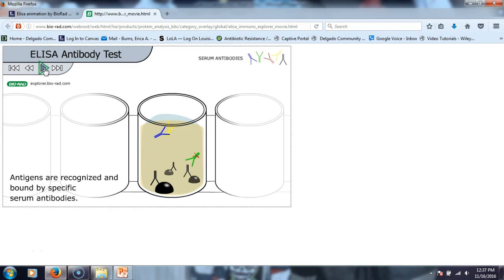We don't have to wear gloves or goggles or any of that today. And all the things that we use that are disposable can go in the regular trash can. Yay! So it's all purified stuff. It's not from patients or anything like that.